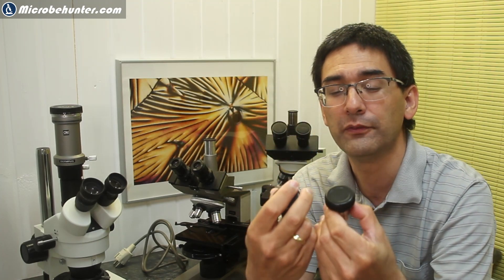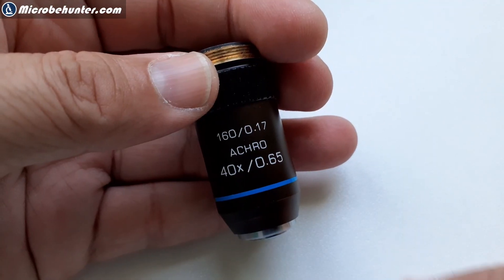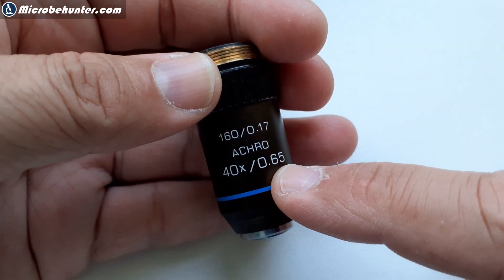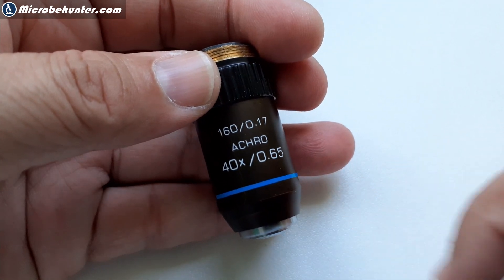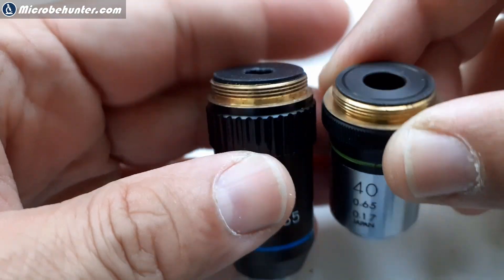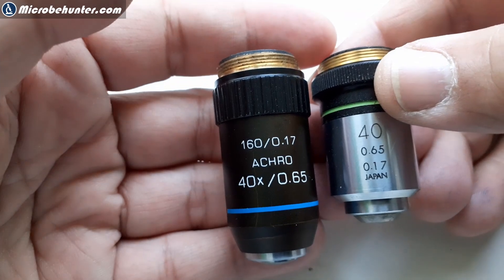The second question is now the following. There are a bunch of numbers printed on the objective here. Of course, the magnification, and then there's usually 0.17 written on it. This refers to the thickness of the cover glass. And then there is also a numerical aperture, which is a decimal value. In this case, 0.65 over here, and also 0.65 over here on the other one. Both of them have the same numerical aperture. This numerical aperture is a measure of how much the objective is able to resolve. The higher the numerical aperture, the finer the details that can be resolved.